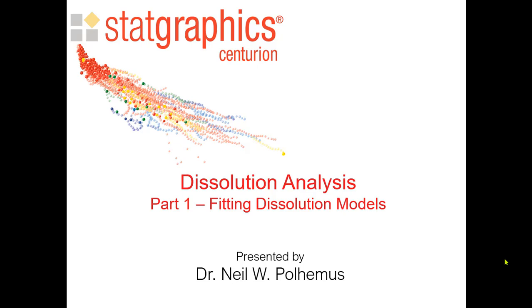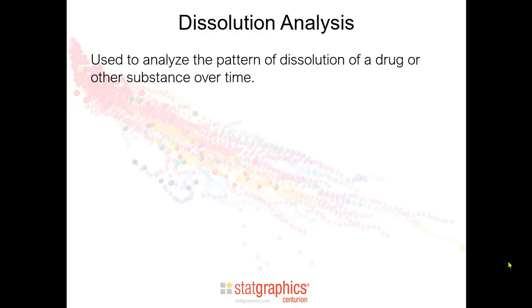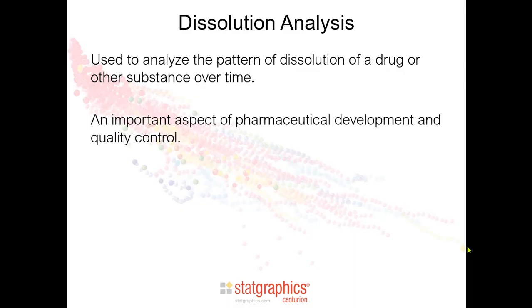This video is the first of three videos describing a new addition to Statgraphics Centurion version 20 for dissolution analysis. Dissolution analysis is used to analyze the pattern of dissolution of a drug or substance over time. It's an important aspect of pharmaceutical development and quality control.